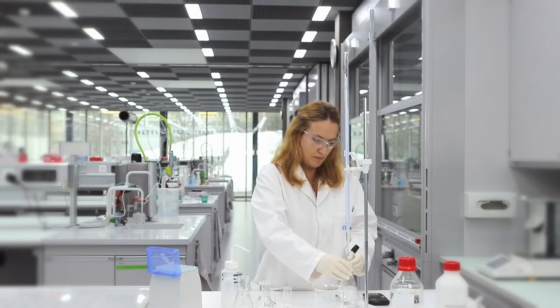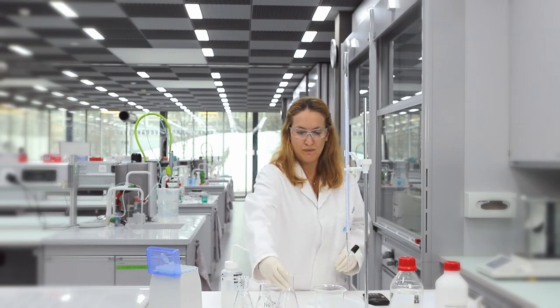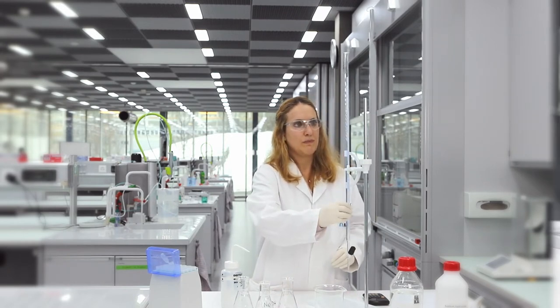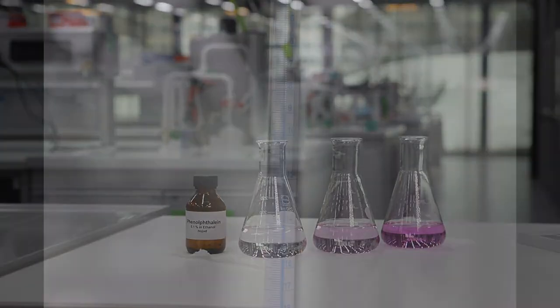My third reason is also very important. With automatic titration, the titration endpoint is evaluated automatically. This means your results will be more reliable and reproducible. When performing a manual titration, detection of the endpoint can be difficult. One drop of titrant can already drastically change the color of your solution. Also, color perception can depend on the operator.